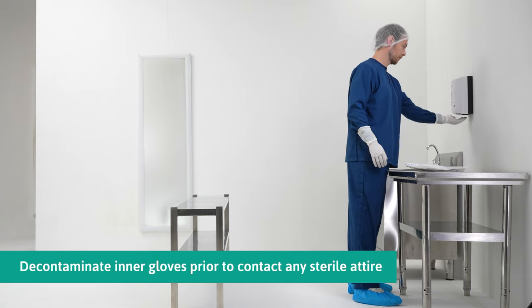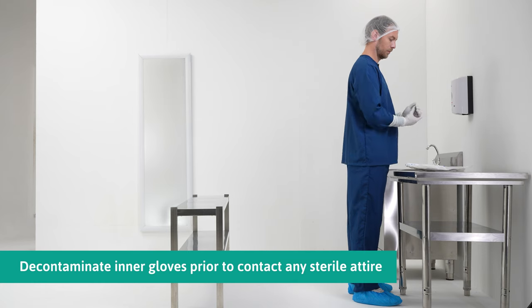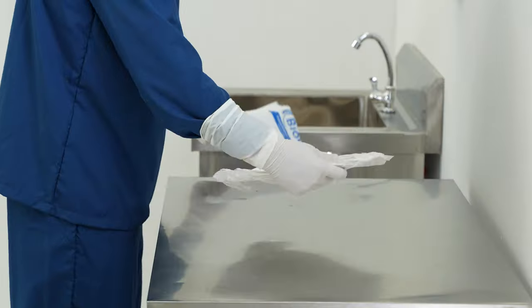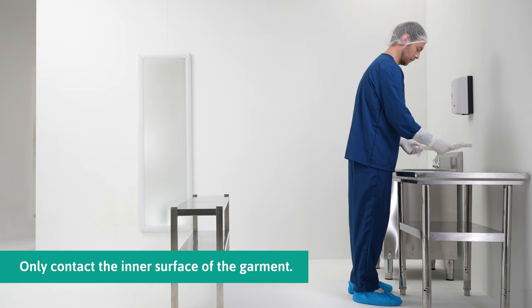Disinfect the gloves prior to retrieving the sterile contents from the packaging. Retrieve the coverall from the package, touching only the inner surface of the garment.